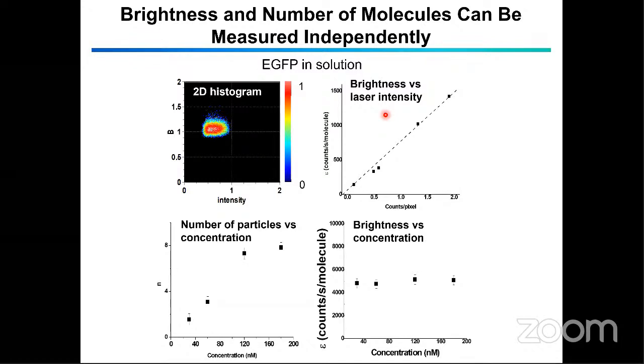So again, if you do the measurement, put on your cells and find a good laser setting where you can get a decent signal from your cells, but then keep it at that. Because if you change it, your data will not be comparable. The same is true for the gain of your photomultiplier. If you change that, you will get different values for different measurements, and you can no longer compare them. So you have to be sure to keep all those parameters consistent during the measurement.